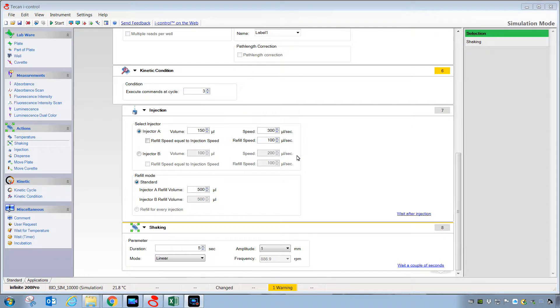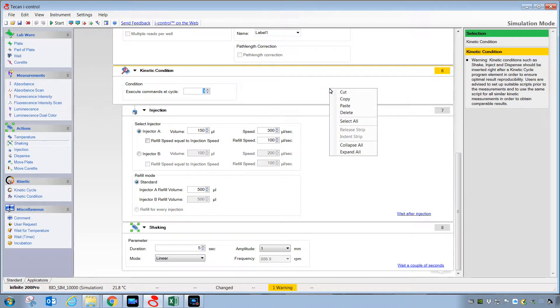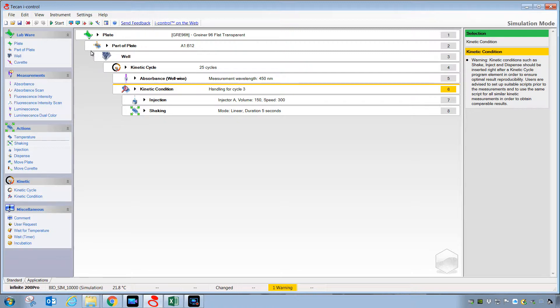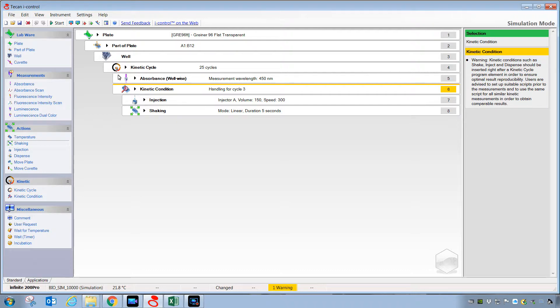It's worth noting again, if we were to compress down or collapse down all these steps, we will collapse all. Let's look at the indentation again, so we can understand the flow or logic of what is happening. So we have a plate, and then we are measuring part of that plate, and then we're going to process well-wise a kinetic cycle. That kinetic cycle has these steps nested within it all the way down to here.